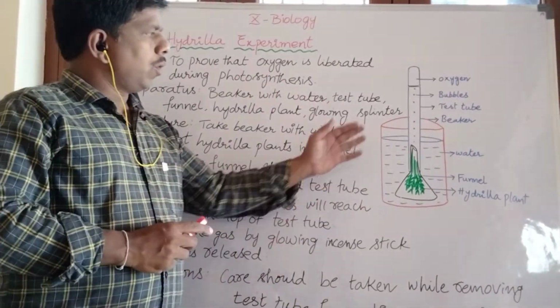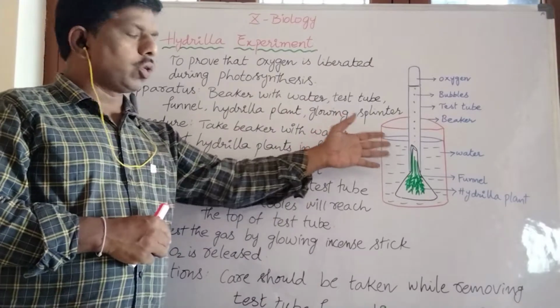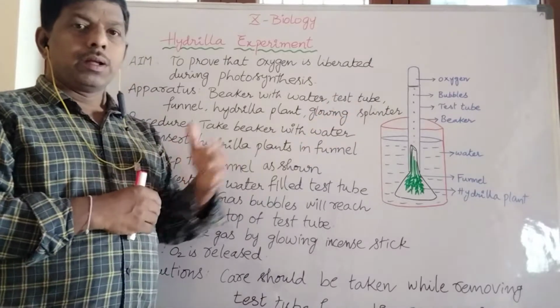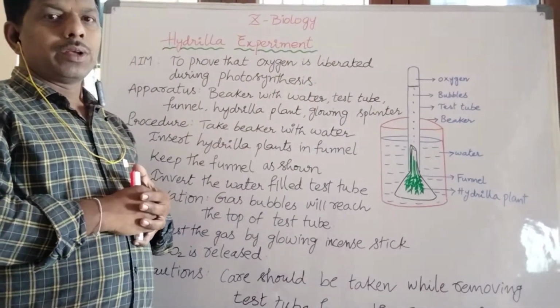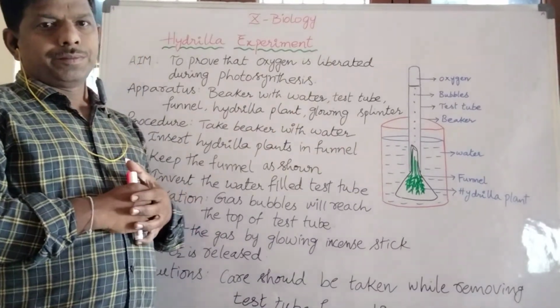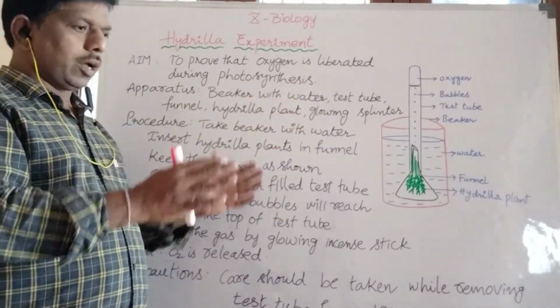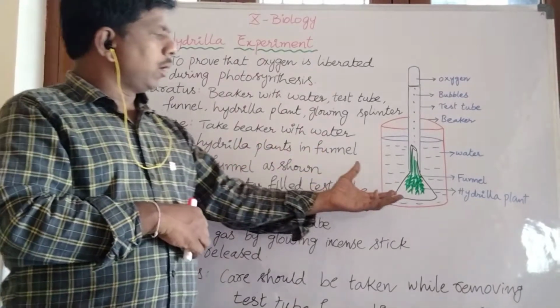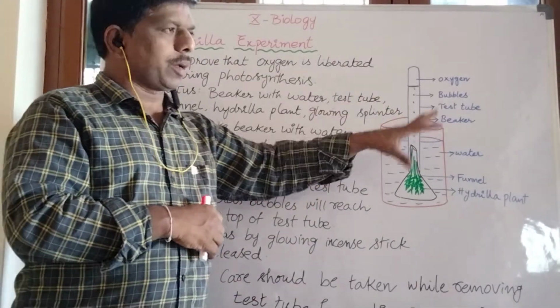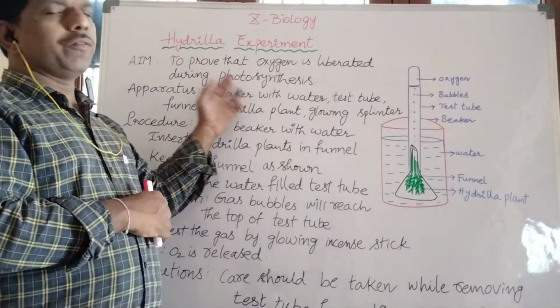Then we have to keep this whole apparatus in sunlight for nearly 2 to 3 hours. Why do we have to keep it outside? To get sunlight. To do this photosynthetic experiment, we have to keep it outside, not in a closed room. So we have to take this whole experiment into the sunlight. We have to keep all this apparatus in the sunlight for nearly 2 to 3 hours for photosynthesis to be performed.